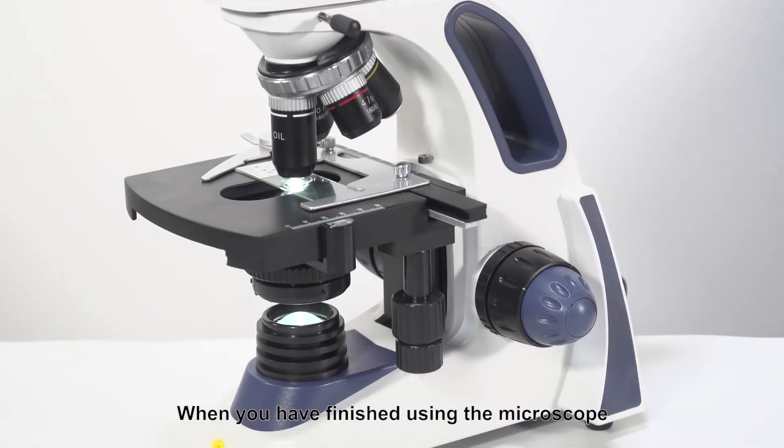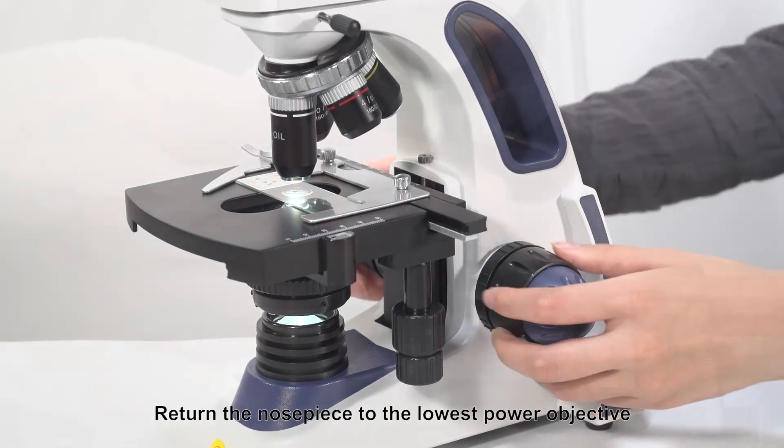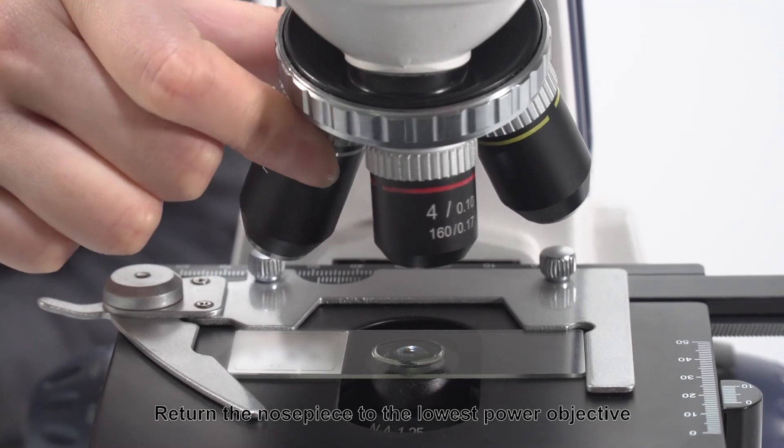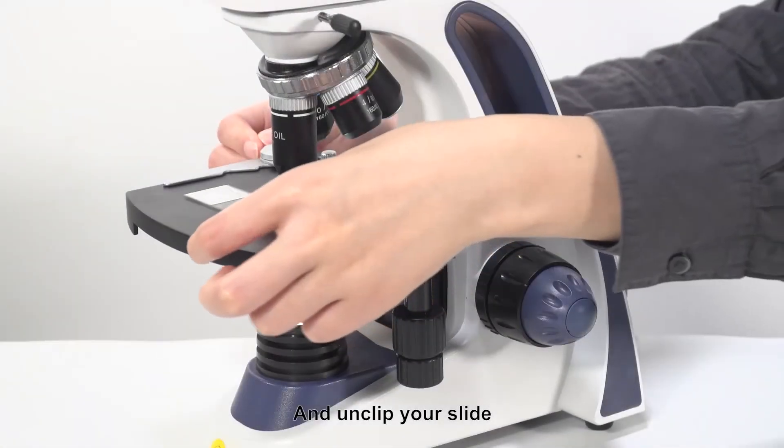When you have finished using the microscope, move the stage away from the objectives. Return the nose piece to the lowest power objective and unclip your slide.